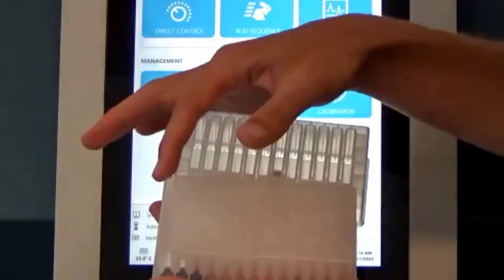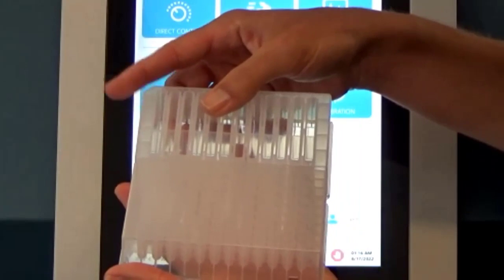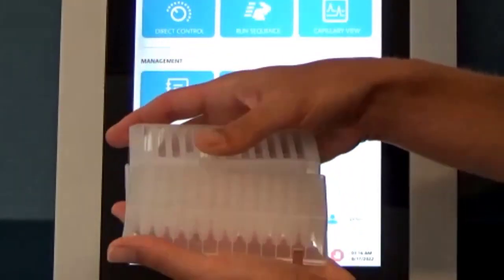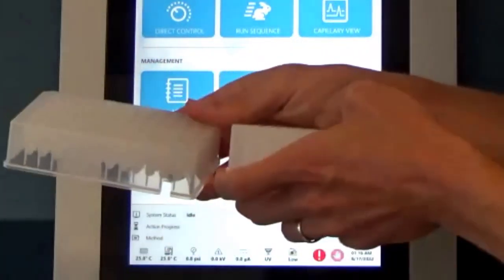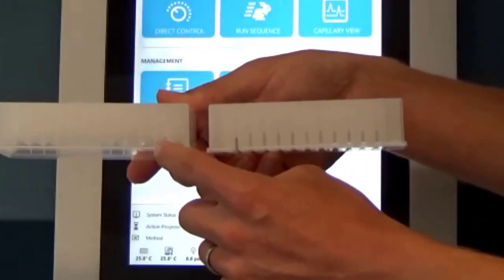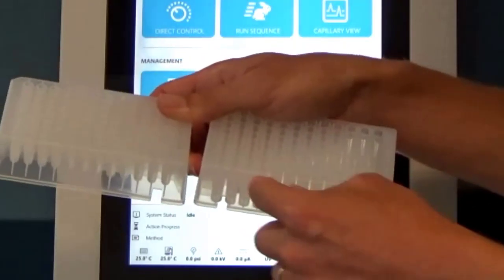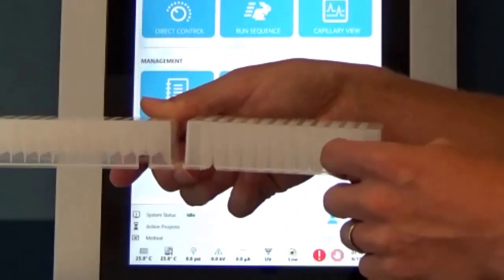Now we'll notice that each plate has this little notch, this 45-degree angle at the top to make sure that when we load it onto the system, we're loading it correctly. And for the reagent and sample plates, they have little notches or keys on opposite sides to ensure that we put them in the right spot. So if you try to put this reagent plate where the sample plate should go, it's not going to let you because the notch is not going to fit on that side.